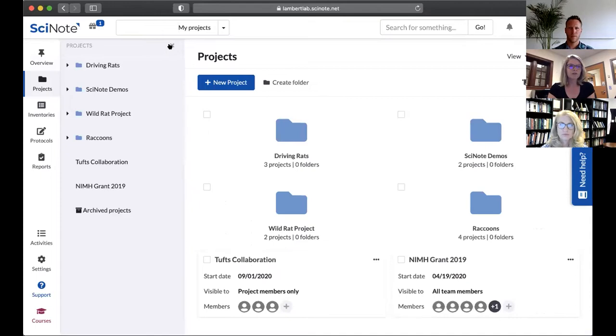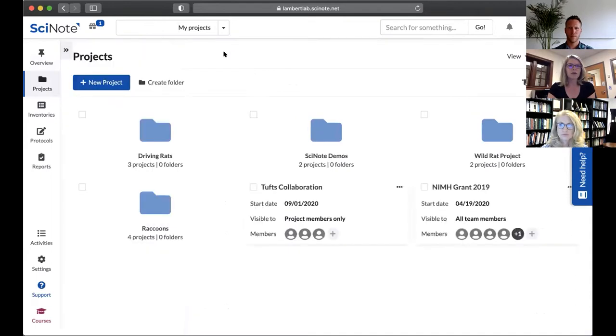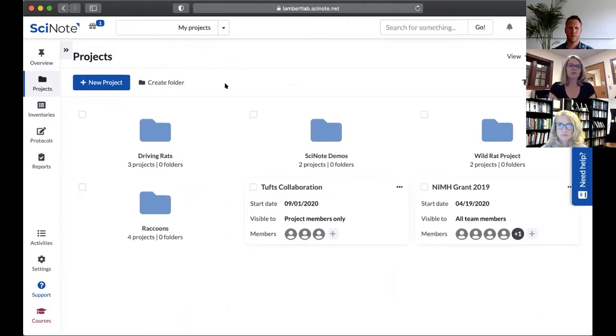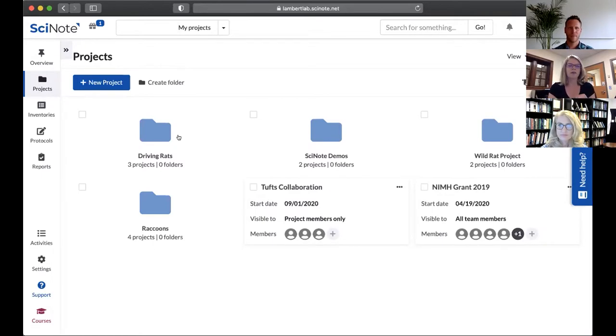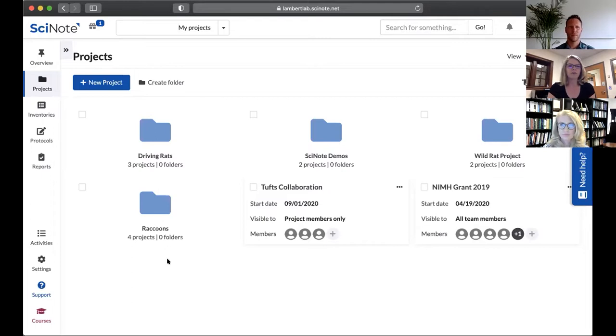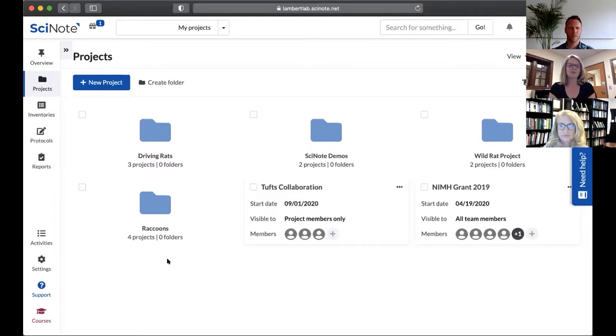Here you can see where we've organized our projects. One of my favorite updates is this incorporation of folder organization. You heard Kelly mention our driving rats, and we've had multiple cohorts of these animals now, so I've separated and distinguished a folder for each of those cohorts. We also work with animals that are not traditionally utilized in neuroscience research, one of those being the raccoons.